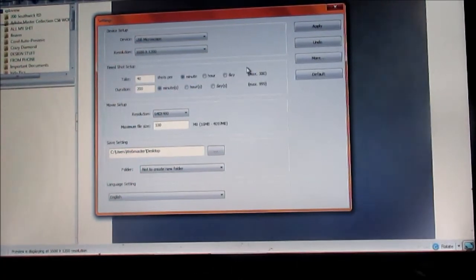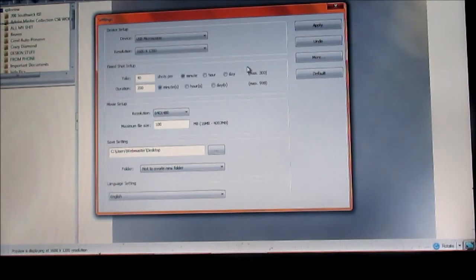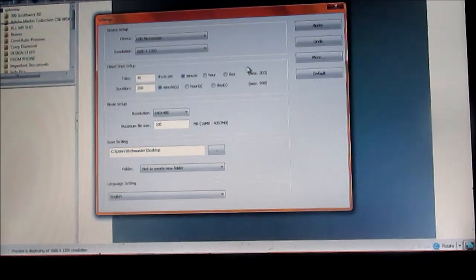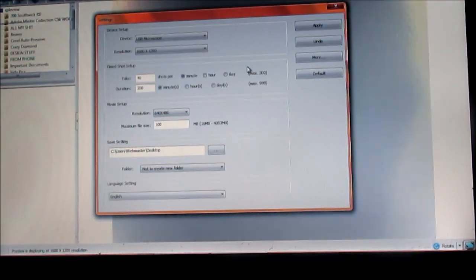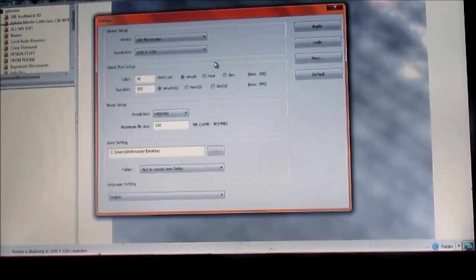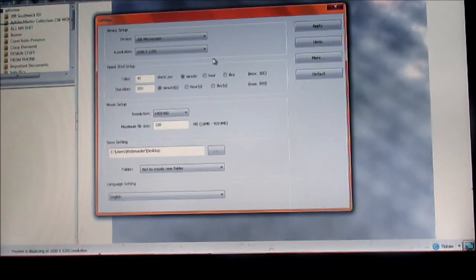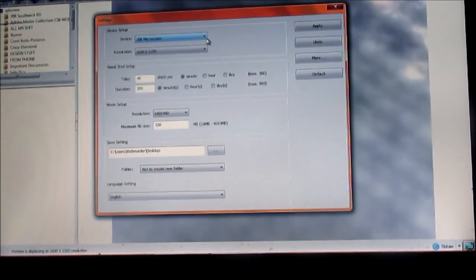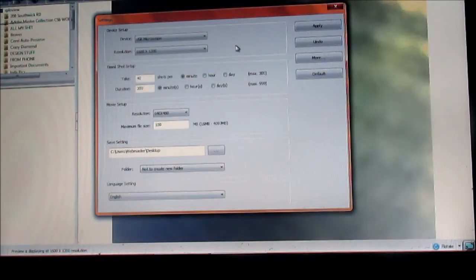I did have some trouble getting it to sync up — the lights on the microscope would come on briefly and then shut off, and even though there was no disconnect sound from the computer, it still wasn't registering in the drop-down. What I did was — it was set on the webcam — I messed with the resolution, and when I chose the interpolated resolution it kind of freaked out or something, and then all of a sudden the USB microscope was discoverable in the drop-down. I don't know exactly what I did, but it worked.